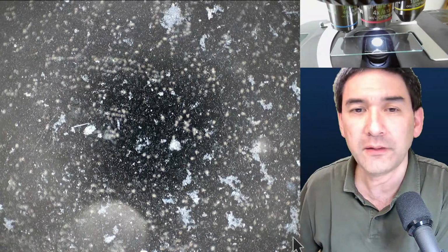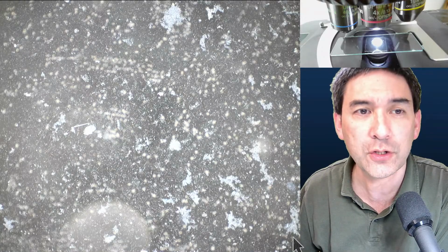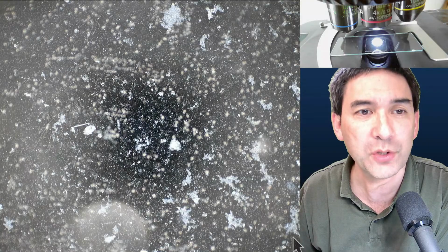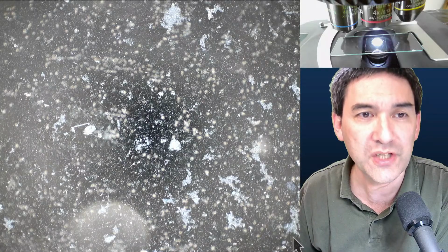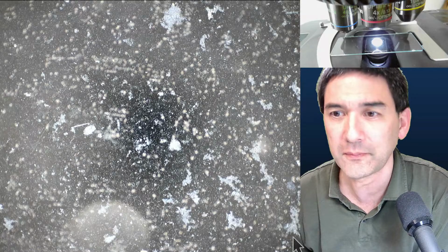So this is a little bit of a limitation of my microscope here, because actually this is not a dark field filter, but it's actually for phase contrast. The phase contrast patch stop, which also works as dark field. And look, if I change the condenser around, that's a little too much. So the short answer is, are you able to see bacteria with dark field? The answer is clearly yes.